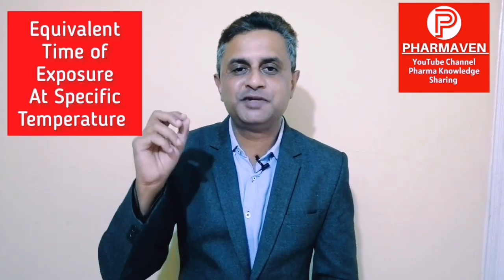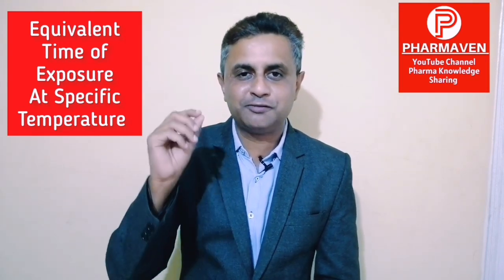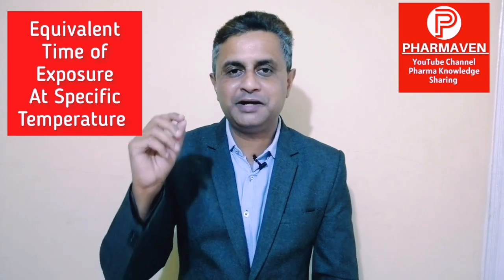So what is that F value? F value is the equivalent time of exposure at a specified temperature. It is a time. F0 value or F value or FH value is always a time. It is not degrees Celsius. So equivalent time of exposure at a specific temperature. When I say 121, then if I calculate F value starting from 100, what does it mean? That in the entire exposure from the temperature 0 to 100 to the completion of the sterilization hold, what was the equivalent time of exposure? So it calculates each and every minute's equivalent time.